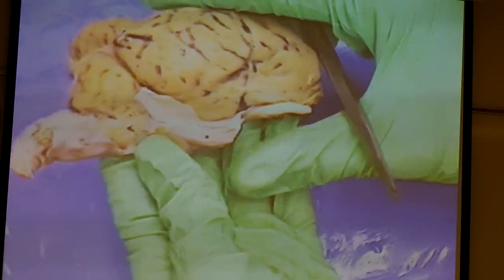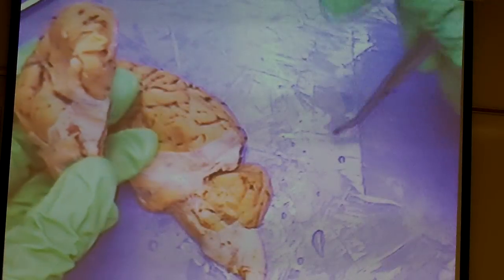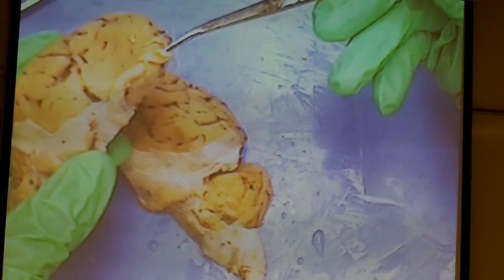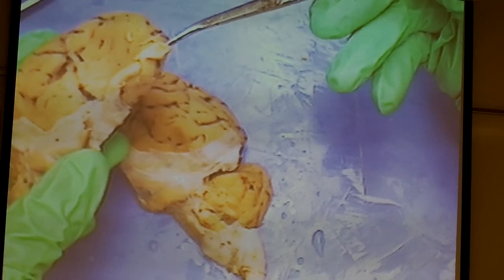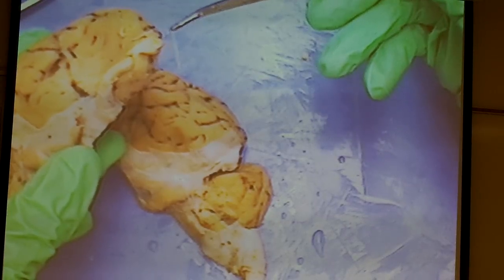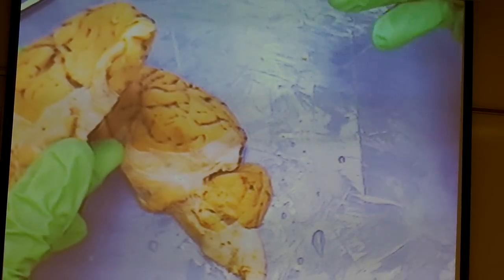Let's first look at the side of the brain and find cranial nerve 1 and 2. Cranial nerve 1 is this little bulb right here — that's the olfactory bulb. It would sit in the cribriform plate, and the nerve endings would go through the olfactory foramina, giving the sheep its sense of smell.